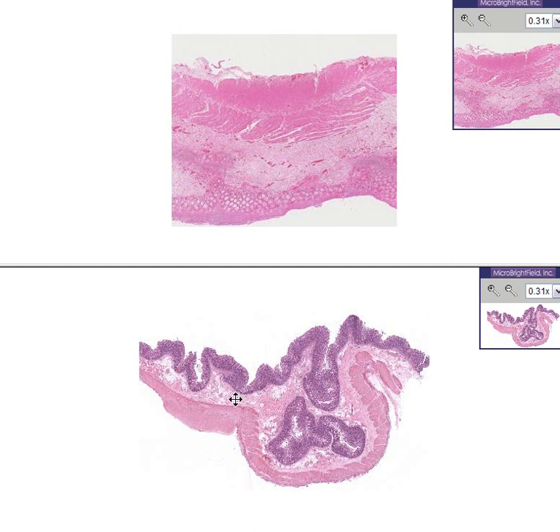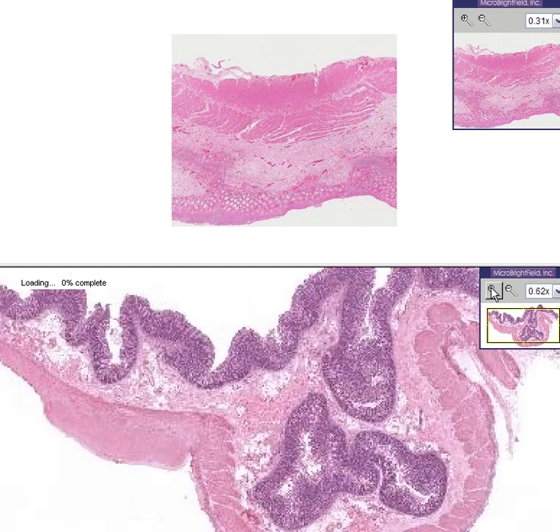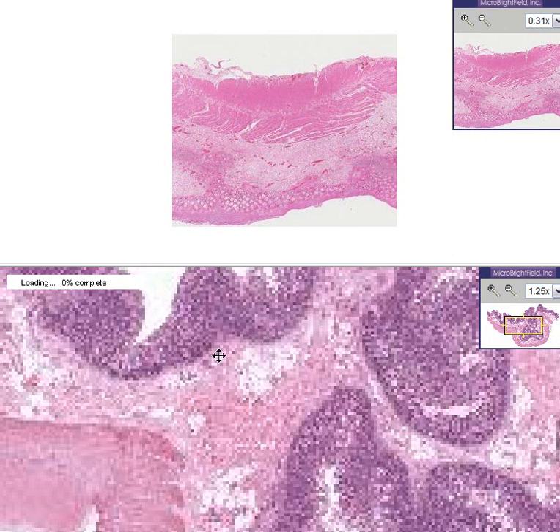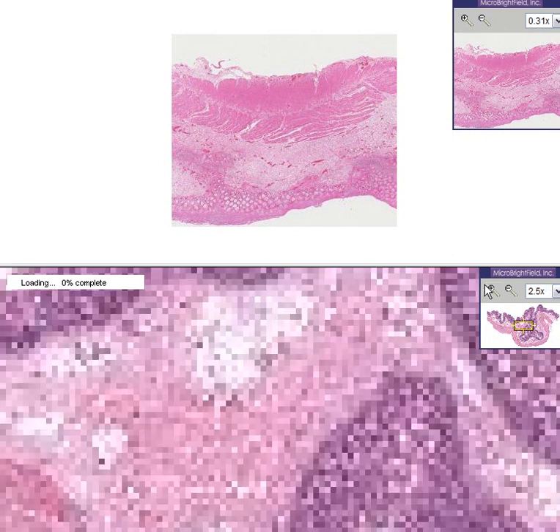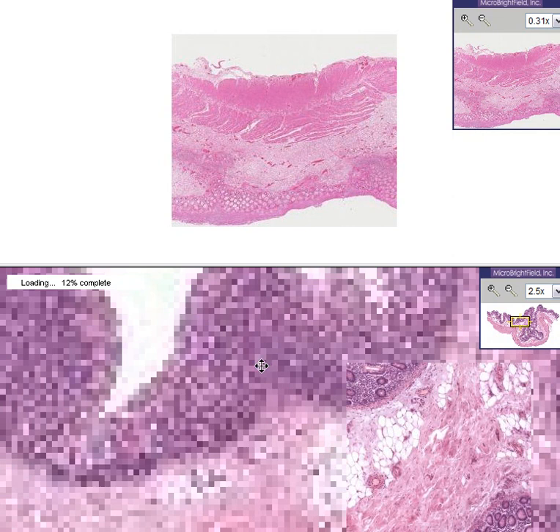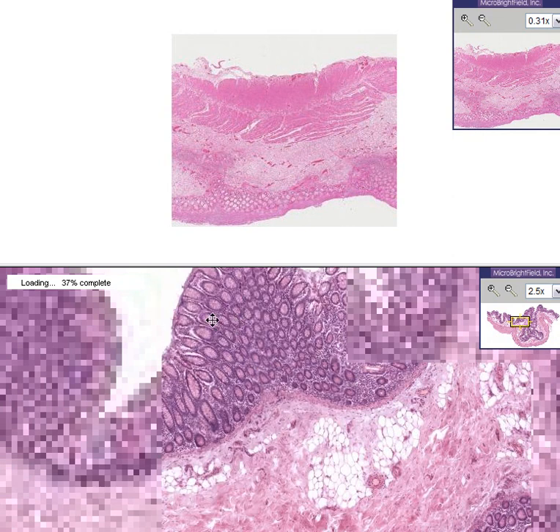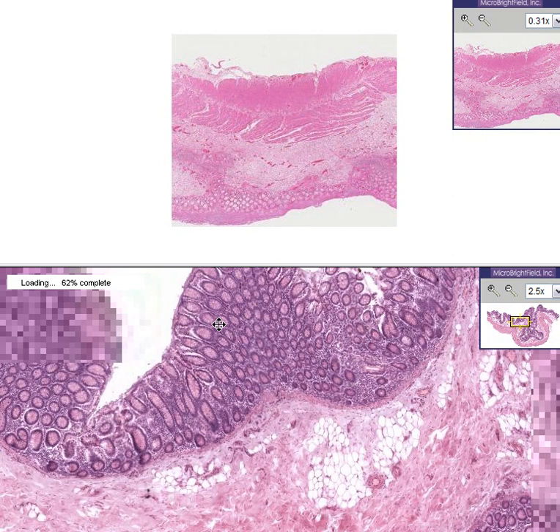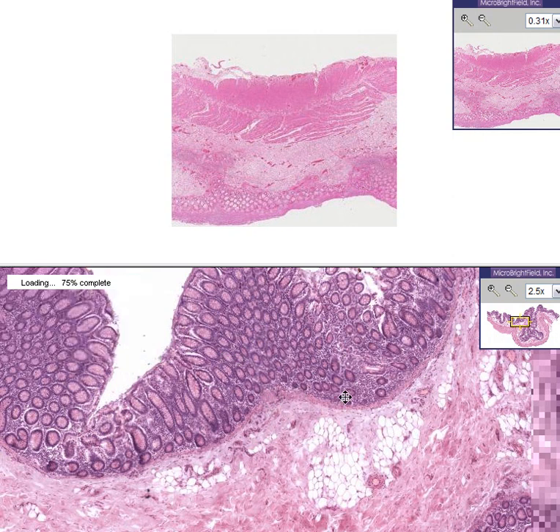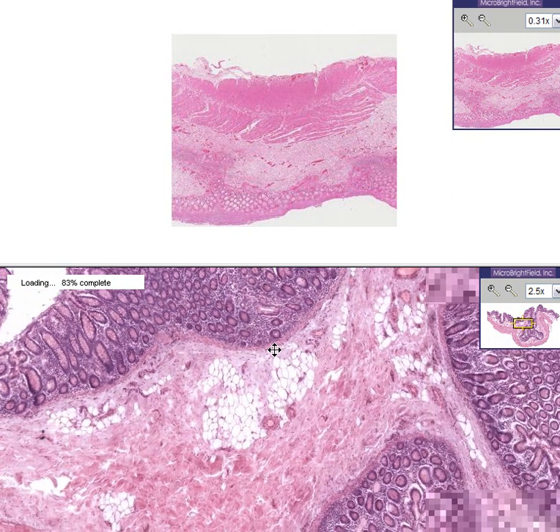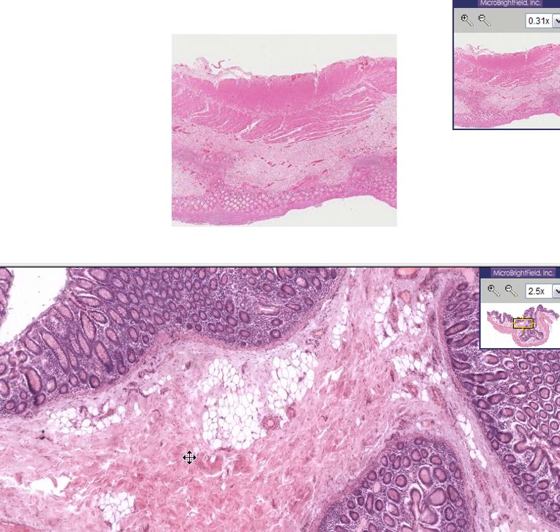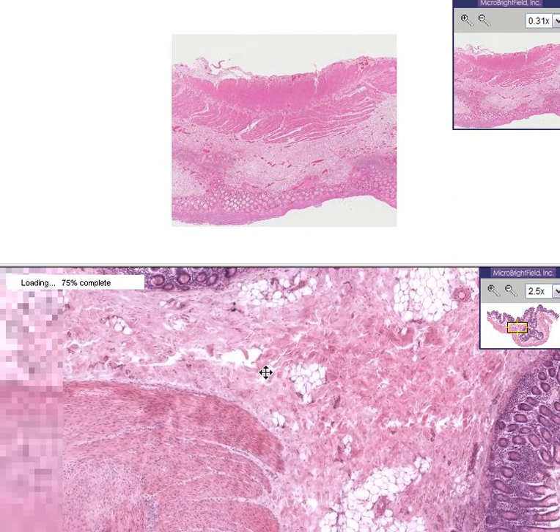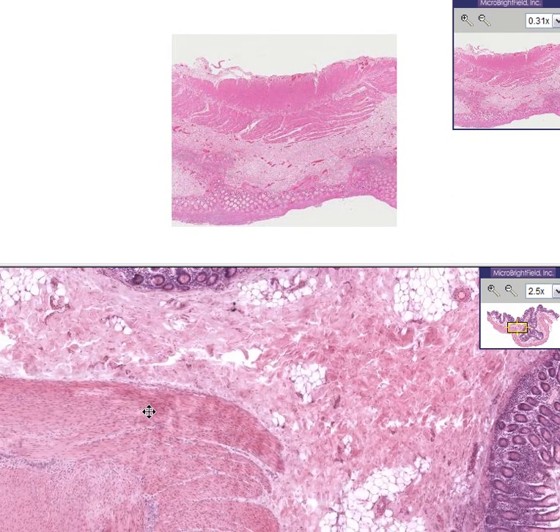Also notice that the submucosa is nice and loose. Here are the nice well-distinct mucosal glands. Here's the muscularis mucosa. Notice that the entire submucosa is nice and loose and vascular and has a little fat loose connective tissue, just like it should be before you actually get into the muscle wall layer.